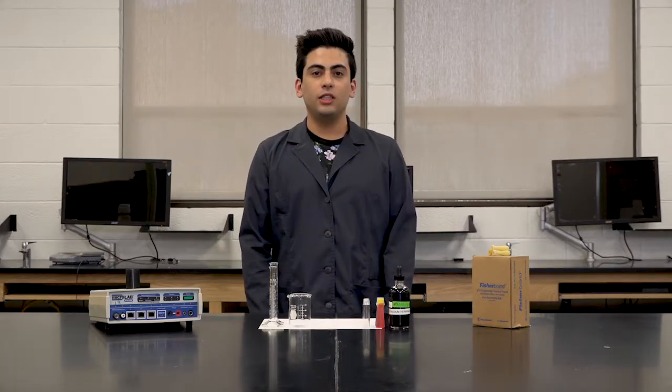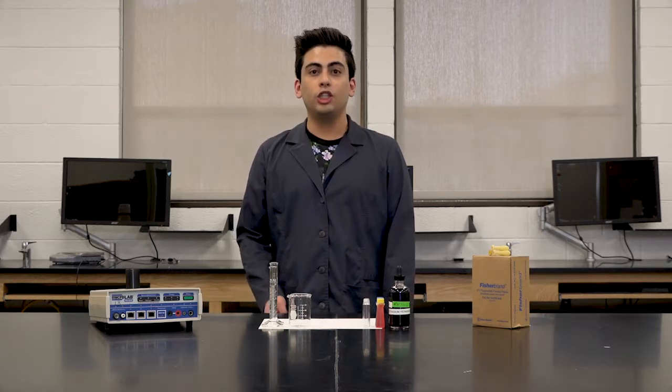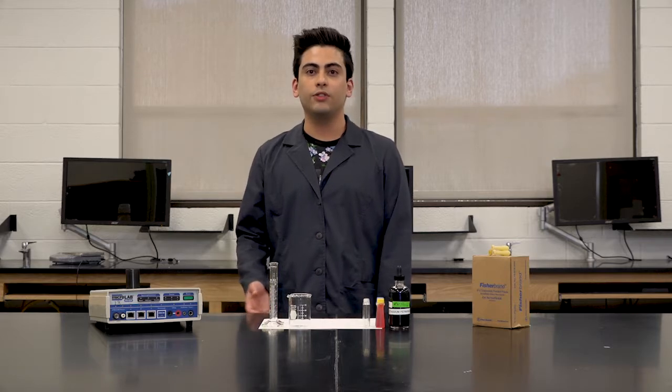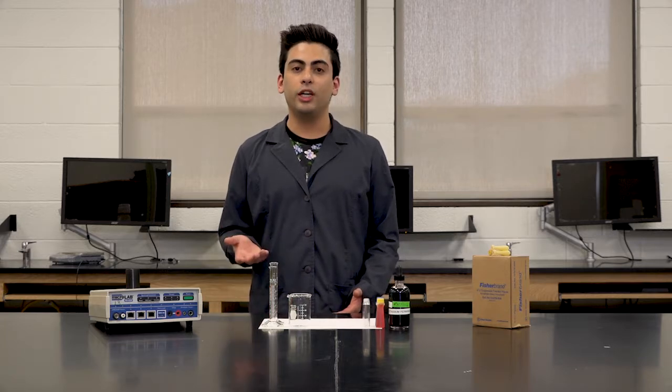The colors that we see on our daily basis are based on the interactions between light and matter. When light and matter interact at the right conditions, there's an energy transfer which causes the absorption or reflection of specific wavelengths, causing different colors that we're seeing. For instance, a material appears white because all of the colors are being reflected and none of them are being absorbed. Meanwhile, a material that appears black is absorbing all of the colors and not reflecting any of them. Therefore, wearing a black shirt on a hot summer day is ill-advised because it'll actually absorb more energy than a white shirt.